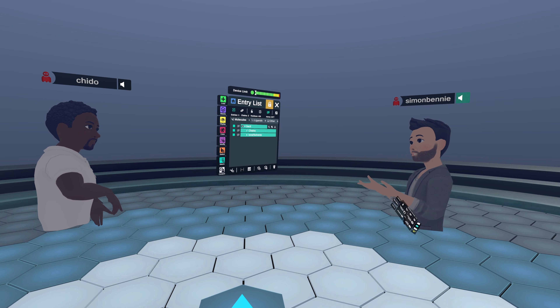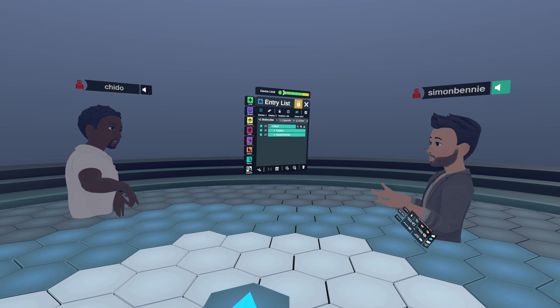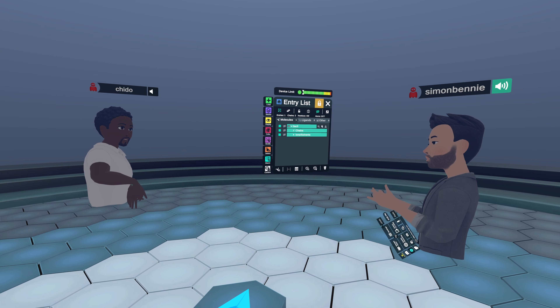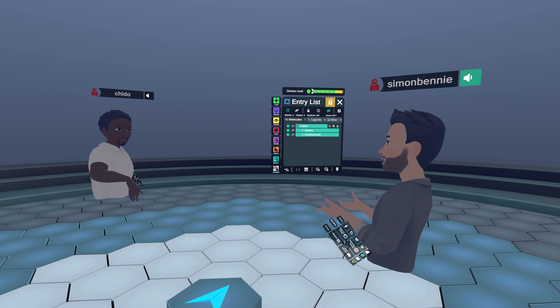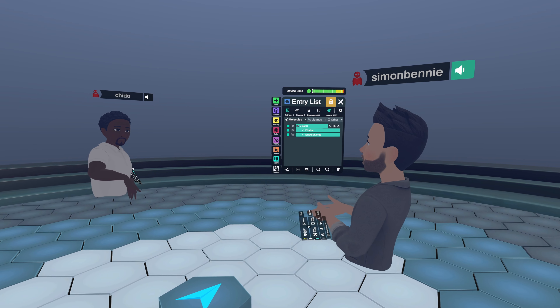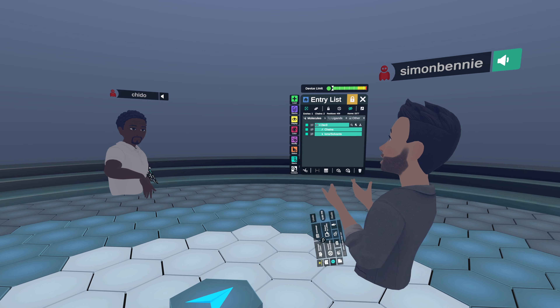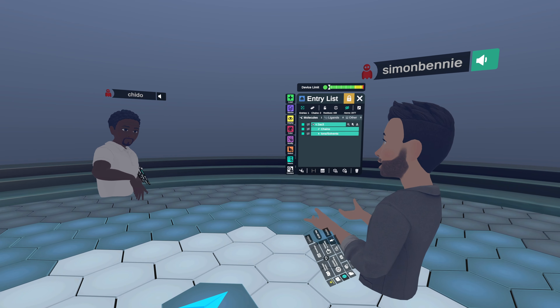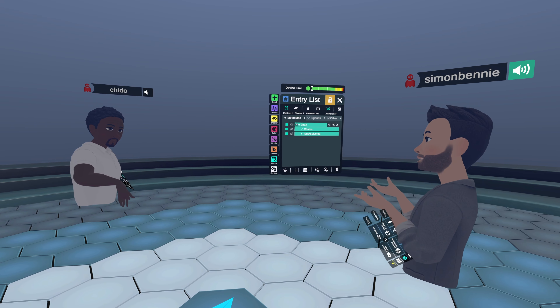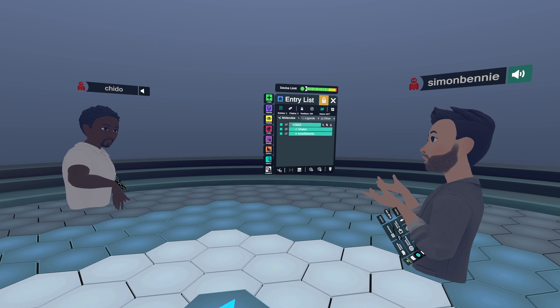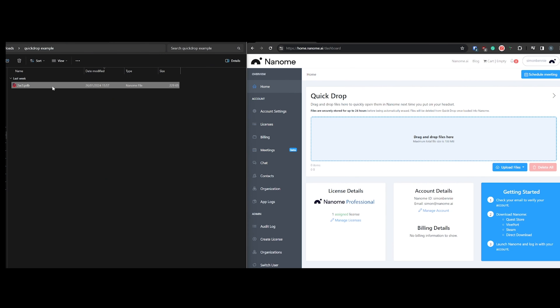Quick Drop is found on the home.nanome.ai website. Once you're logged in, it allows you to drag and drop files so that the next time you open a Nanome session, the molecule loads into the space with you. I'm going to pop up my headset, drag and drop a file, then join a new room together so we can see that molecule.